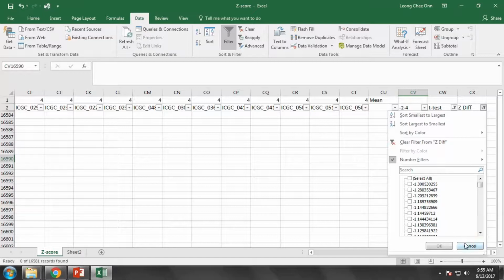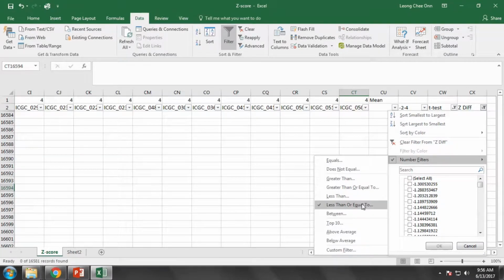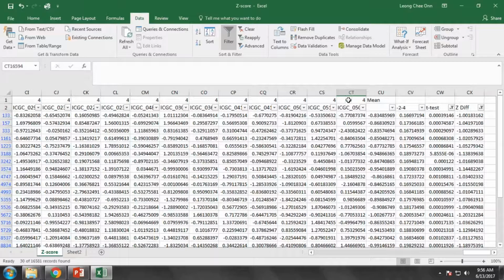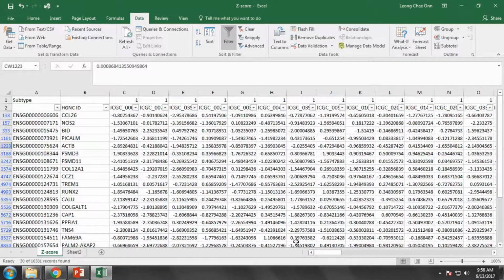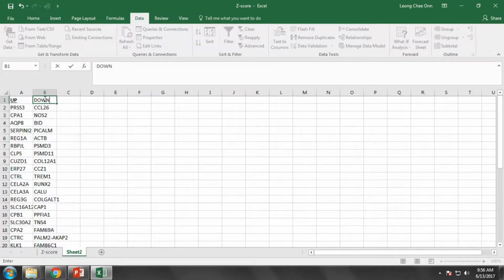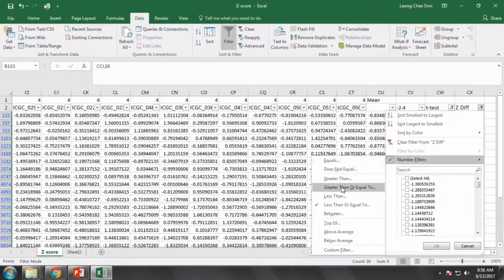So what this shows you is that each of the gene expressions is actually quite varied across the samples. So we probably have to loosen the stringency a little bit more. If we put it less than, let's say, minus 1, and then filter by the t-test, you'll still be fine. So this will be considered downregulated. I have to redo this with the upregulated genes so that they are on the same cutoff.